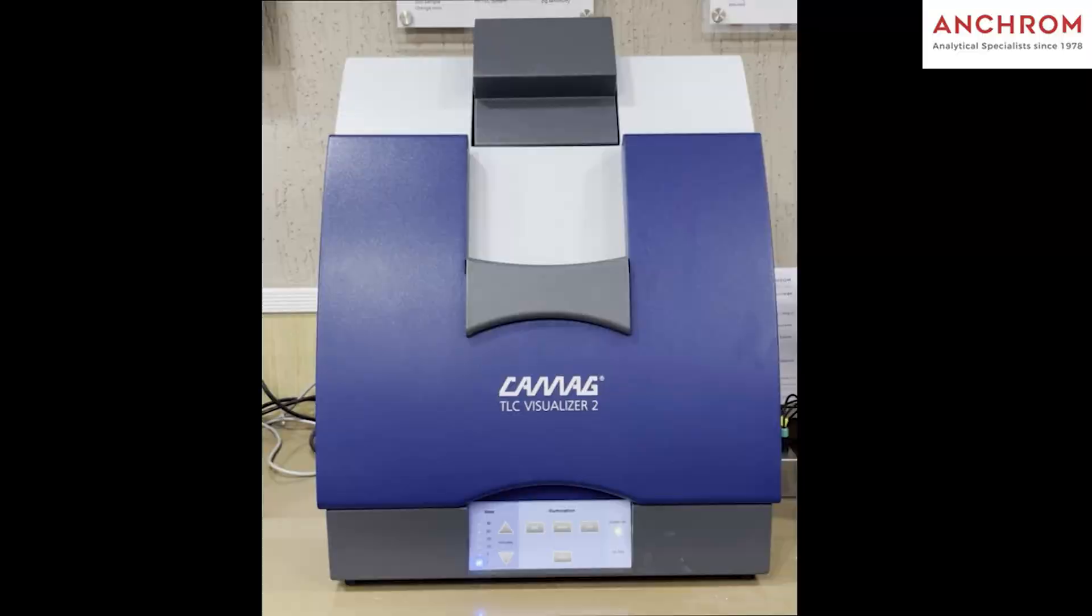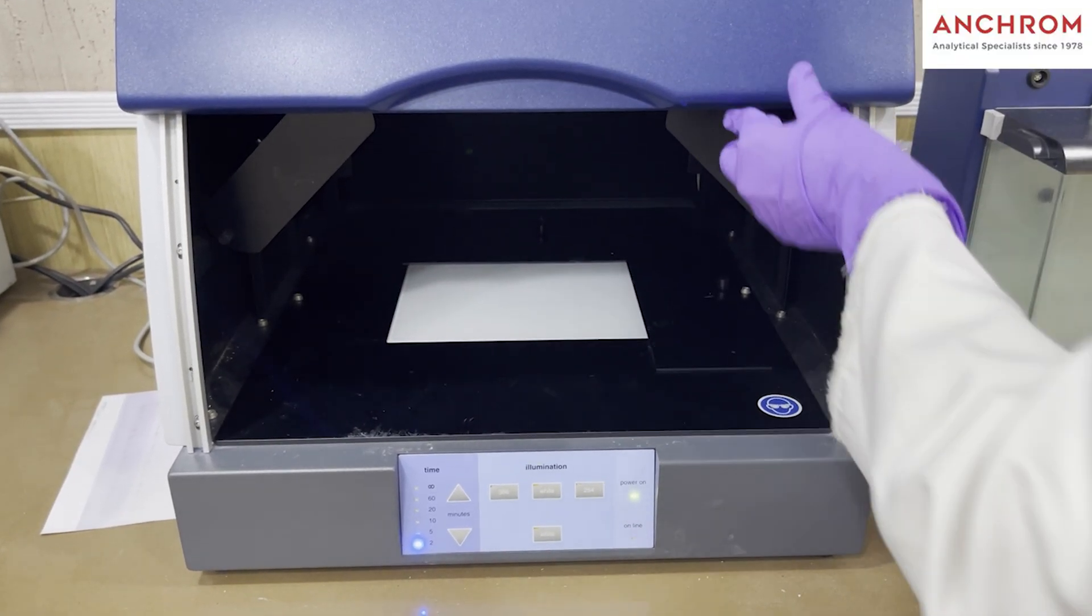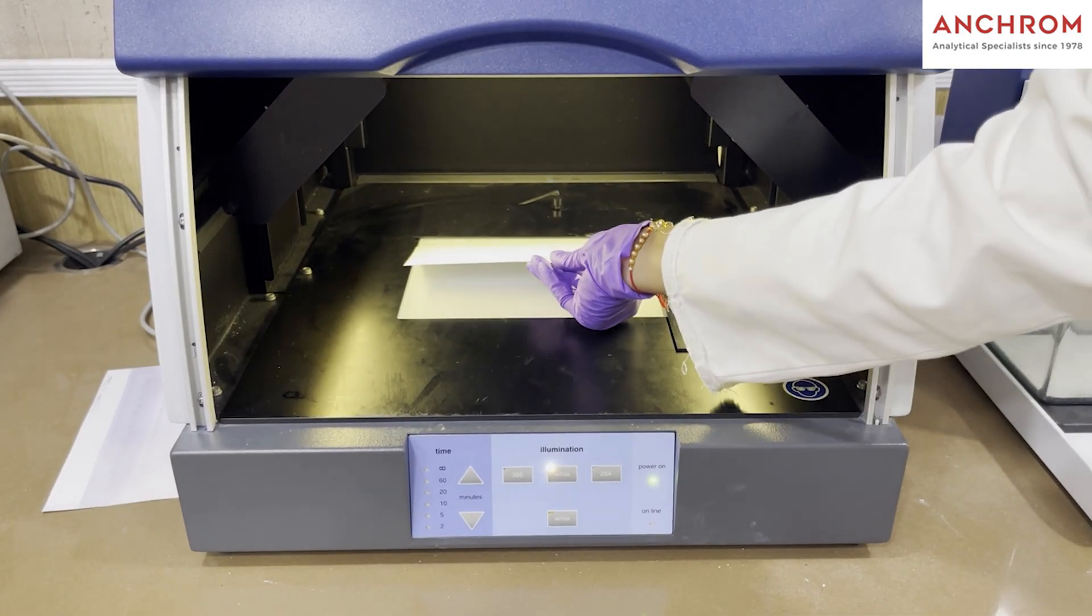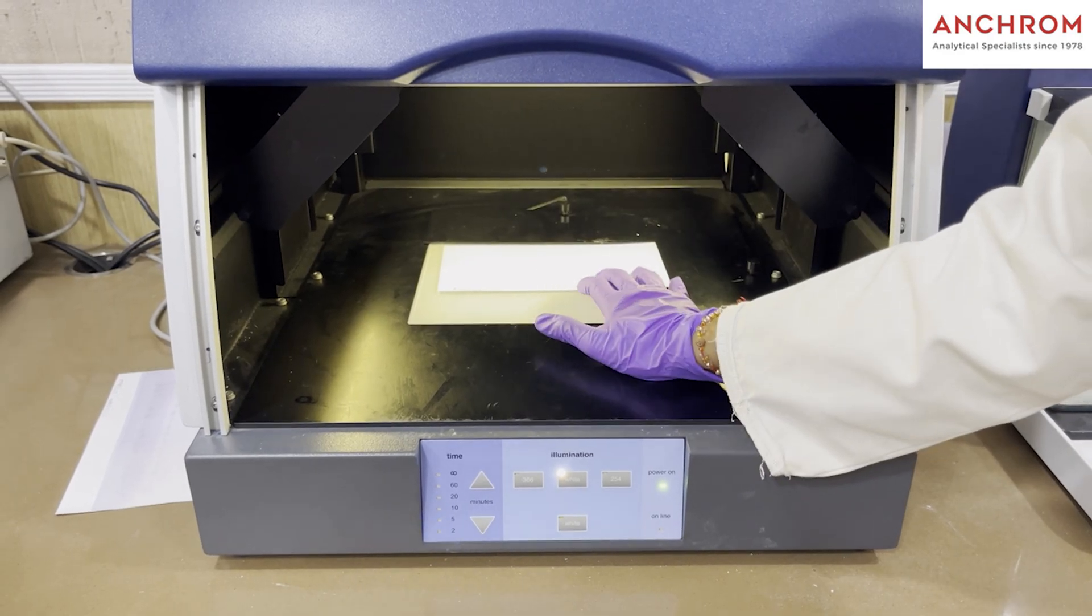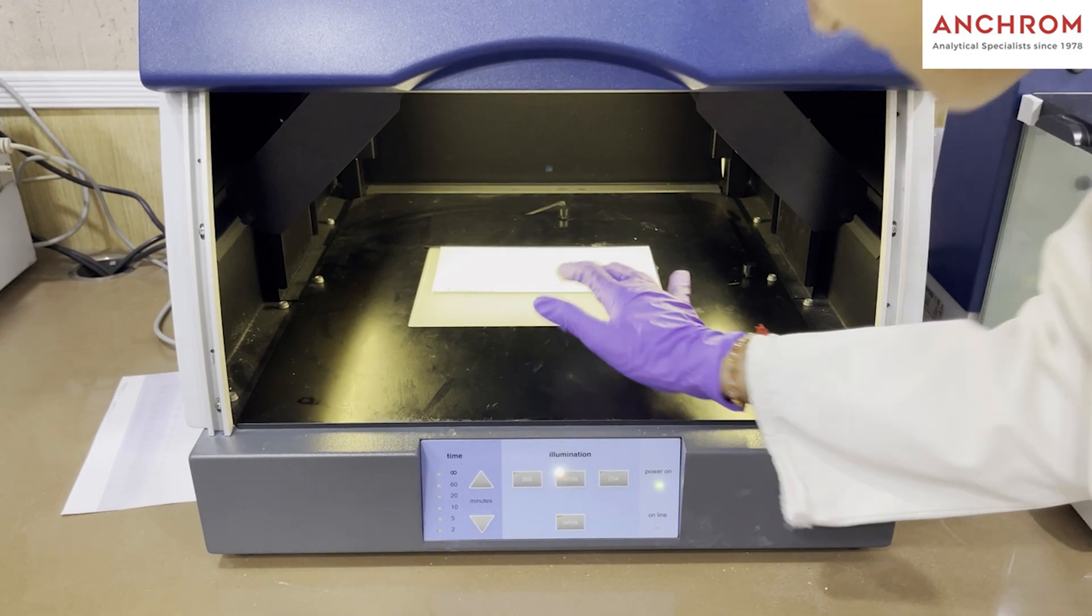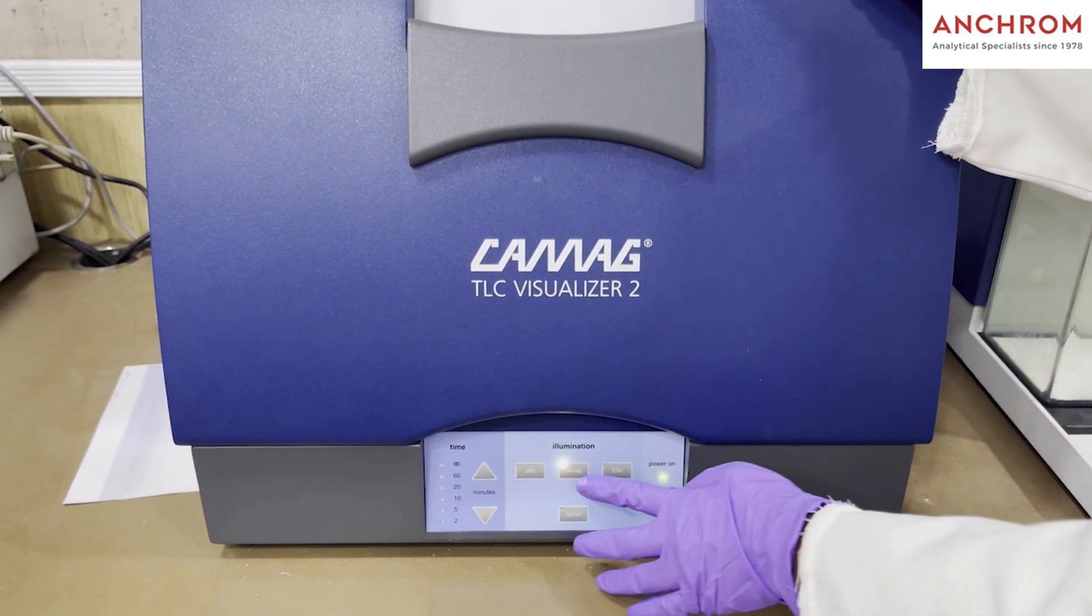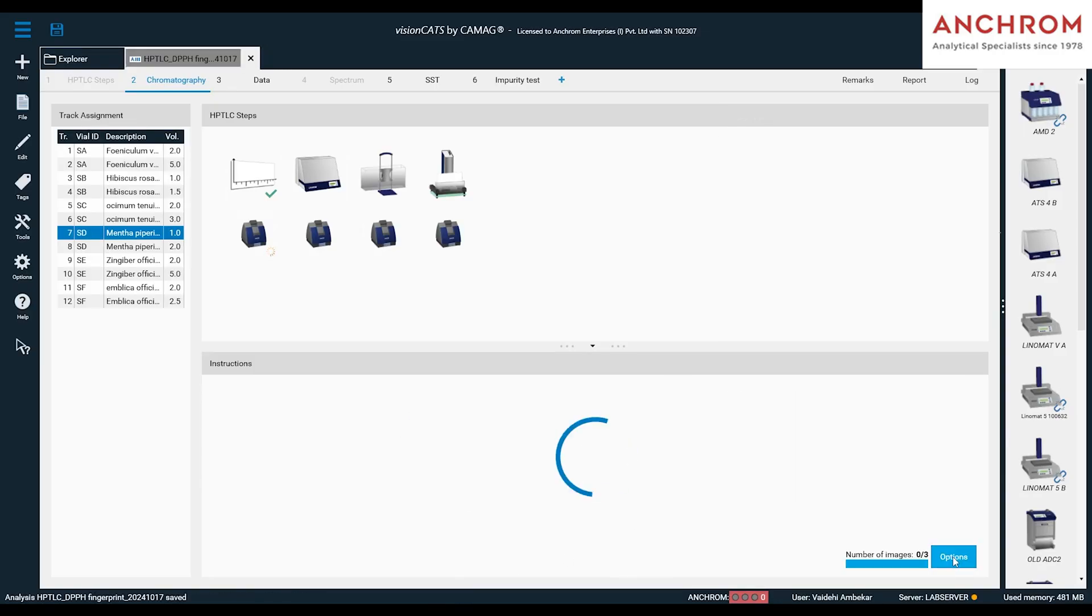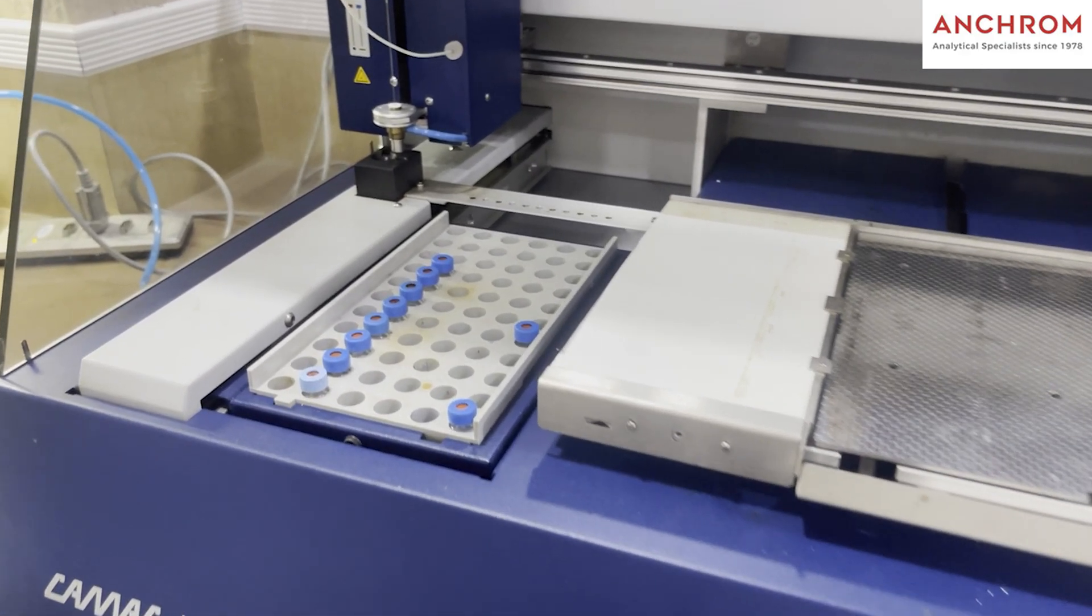So, we will first place the plate in the Visualizer 2 as shown to capture the clean plate image. Then, we will click on continue and clean plate image will be captured. After capturing the clean plate image, we will proceed for sample application.